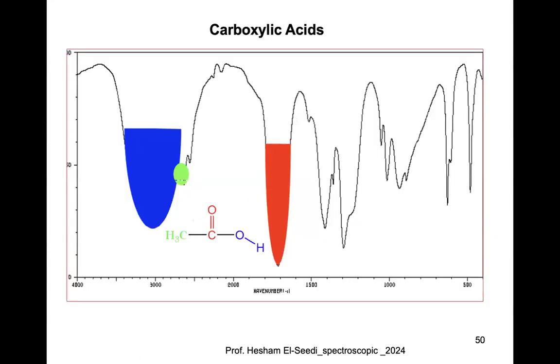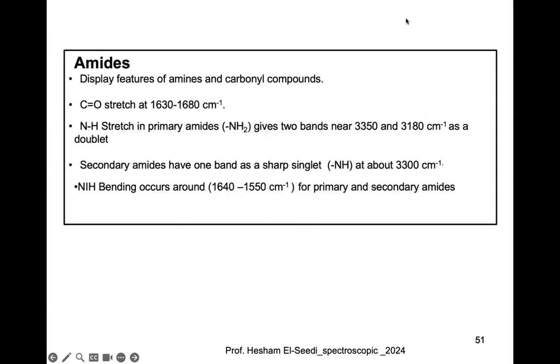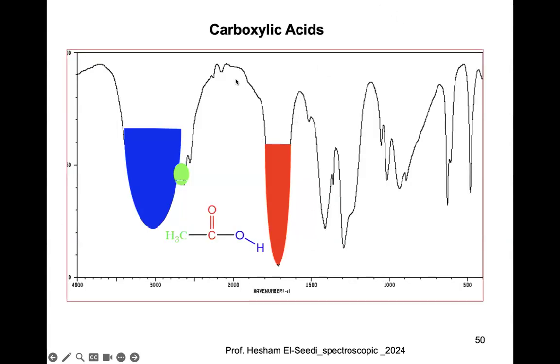What about the very characteristic one, which is carboxylic acid? If it is carboxylic acid, then it takes a very broad peak. It starts from about 2000 to about 2300 to about 3300. Very broad. Immediately we say you have a carboxylic group because it is the OH of the carboxylic acid. So it must be a carboxylic group.